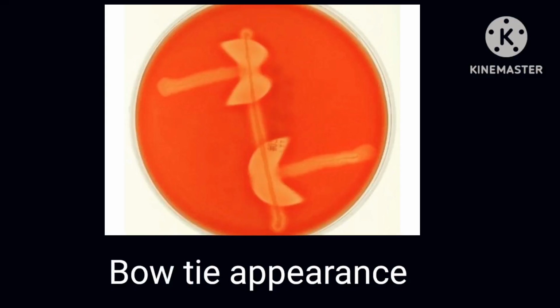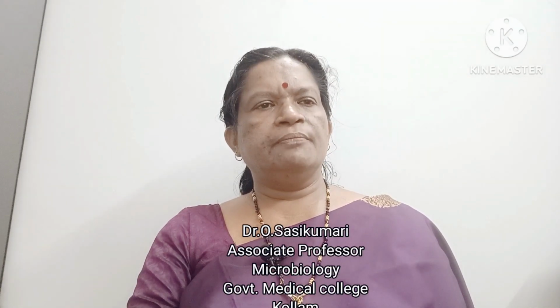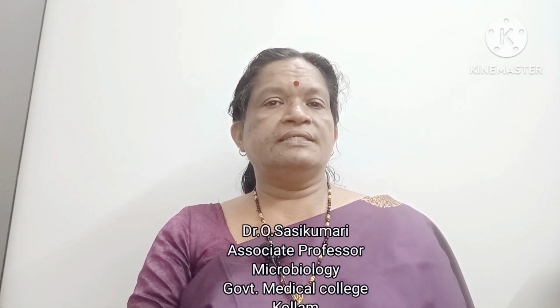It is also called arrowhead appearance, but if you look carefully, it is more like a bow tie and hence it is called bow tie pattern in some textbooks. Alpha toxin produced by Clostridium perfringens, which is a lecithinase, also has a synergistic hemolytic property with CAMP factor produced by group B streptococci.